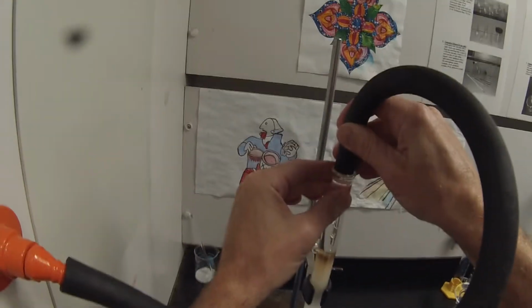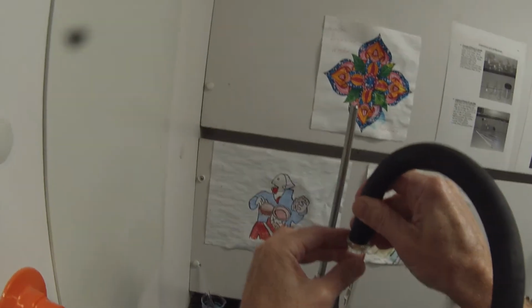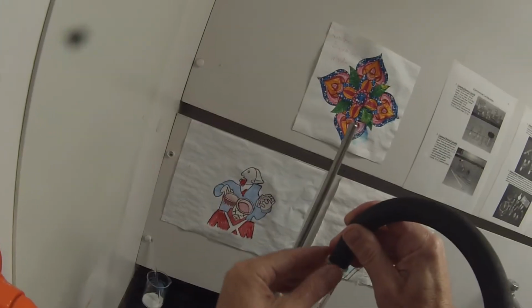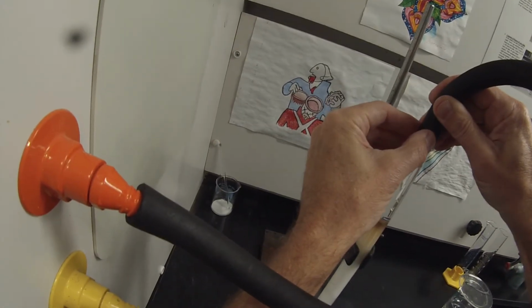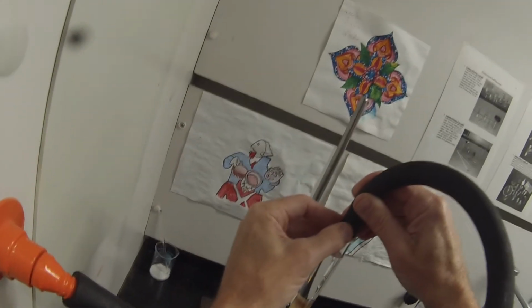And then I can apply some air pressure, which will hopefully get rid of that crack at the top of the column and also speed up the flow a little bit. So I can run this column fairly quickly by applying some air pressure. You can use a much finer grade of silica than we have here. Ours is probably 60 to 200 mesh, which is good for gravity column chromatography.